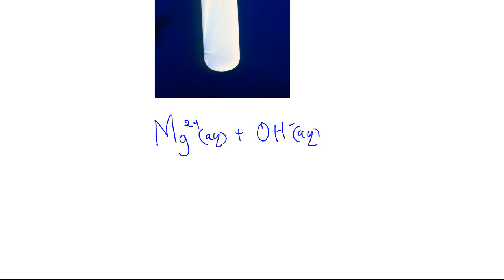Now, the magnesium ion reacts with the hydroxyl ion from sodium hydroxide to form magnesium hydroxide. So that is solid.